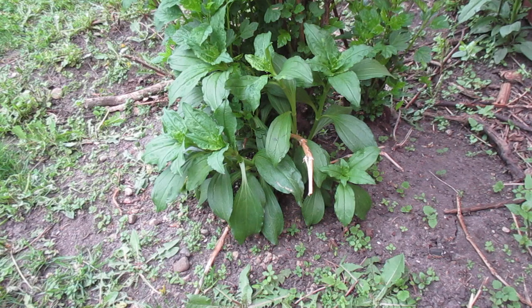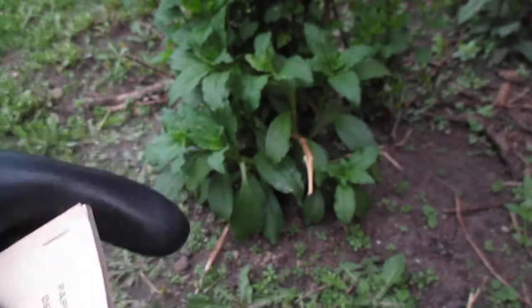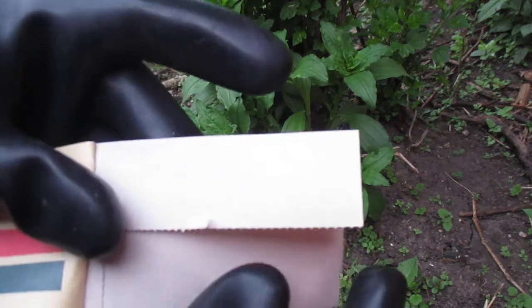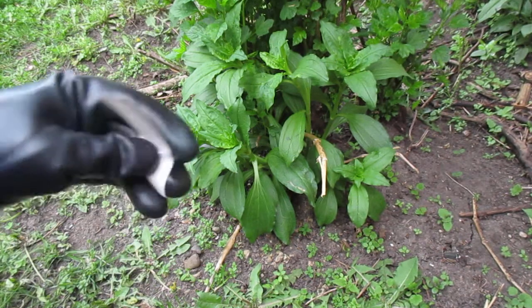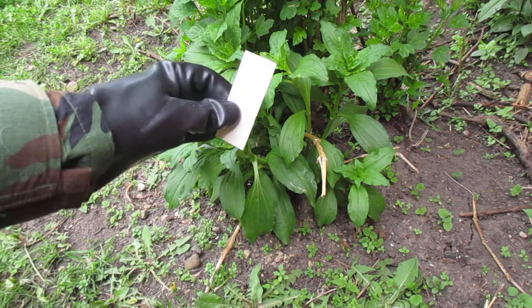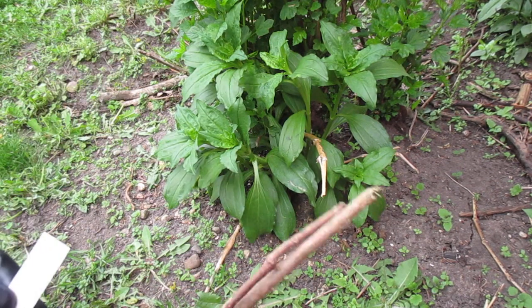One person pulls out the booklet of M8 paper from their mask carrier and opens it up. The sheets are perforated, and you take out half a sheet. You can test it by just blotting, but it is highly recommended you do not get too close to the possible contamination — so you need to use a stick.